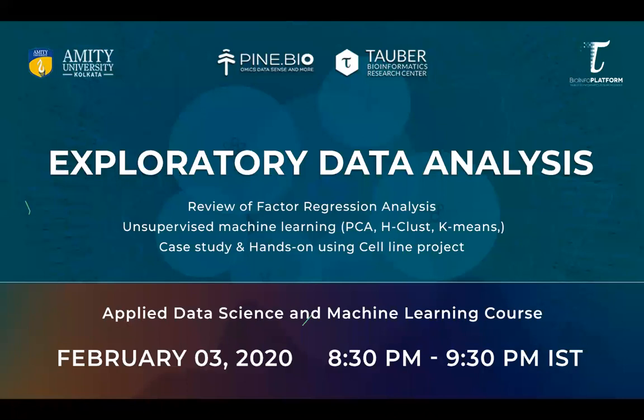So these are all things that we did last time, and today we will look deep into the statistical methods, and in the next class we will start understanding the machine learning algorithms. It will be rather simple to understand the machine learning algorithms, but what we are trying to do in today's class is to learn about the data itself and the statistics involved within that data, the simple or early statistics: when you look at data, how you find differentially expressed genes.